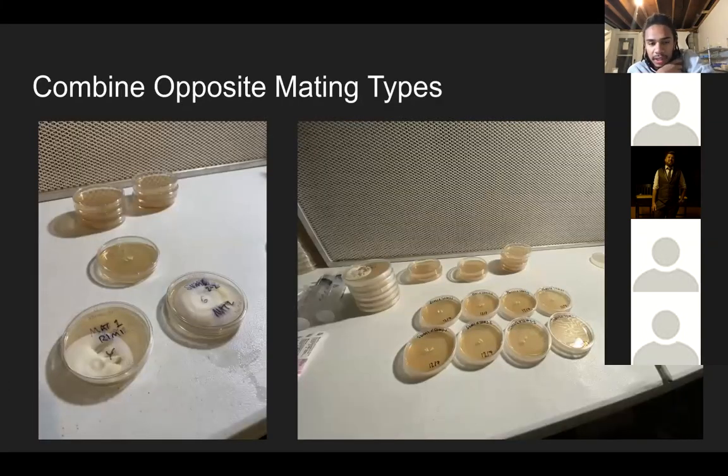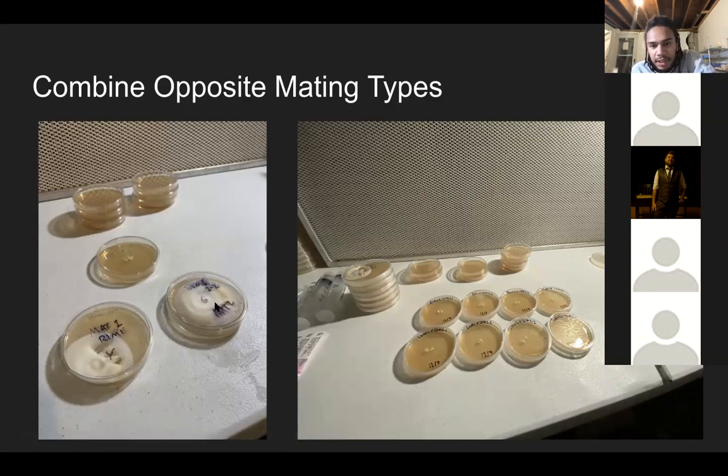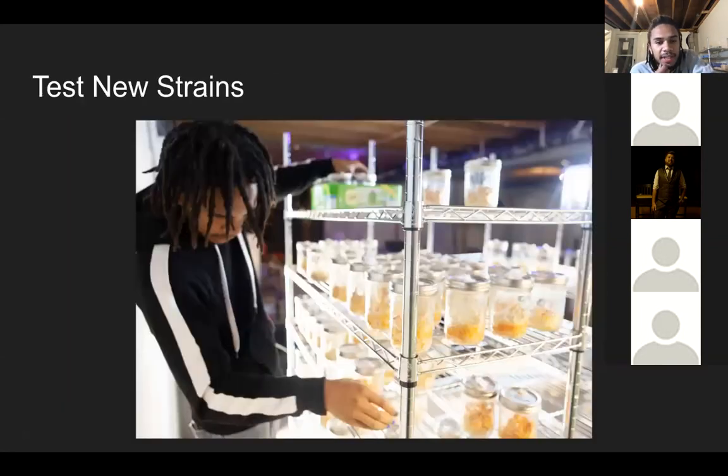Once you know what the opposite mating types are, then you can take a little piece of mycelium from each of the mating type isolates and combine them on a petri dish. So I'll take a little cut of mycelium out of my mating type 1, stick it on a petri dish, take a little cut out of my mating type 2, stick it on the petri dish, and then within the next 2 to 3 days, the mycelium will find each other and they'll breed on the petri dish. Then you need to test your new strains.